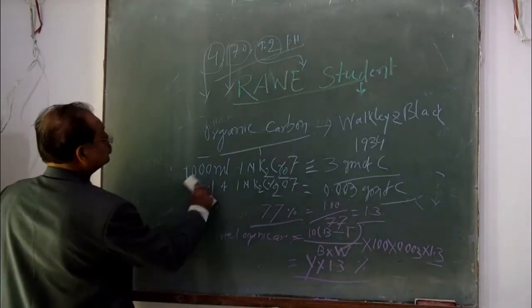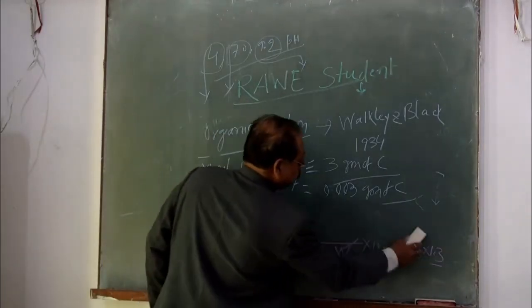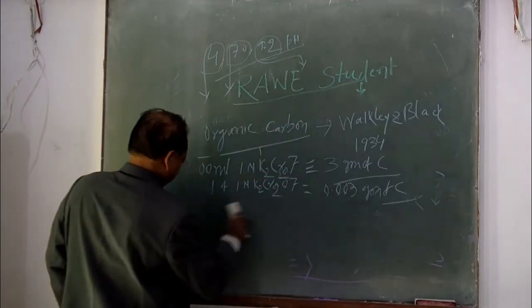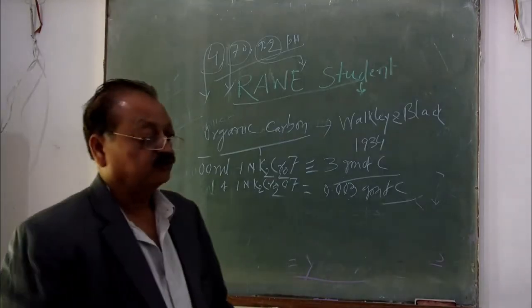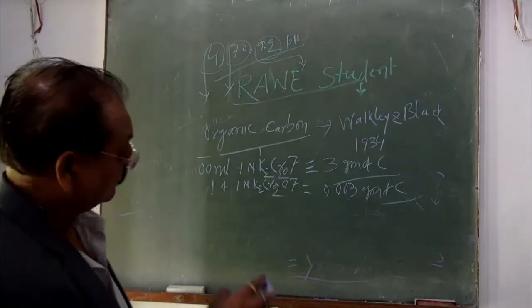Now come, second, now you have to determine the organic matter from the same soil samples.